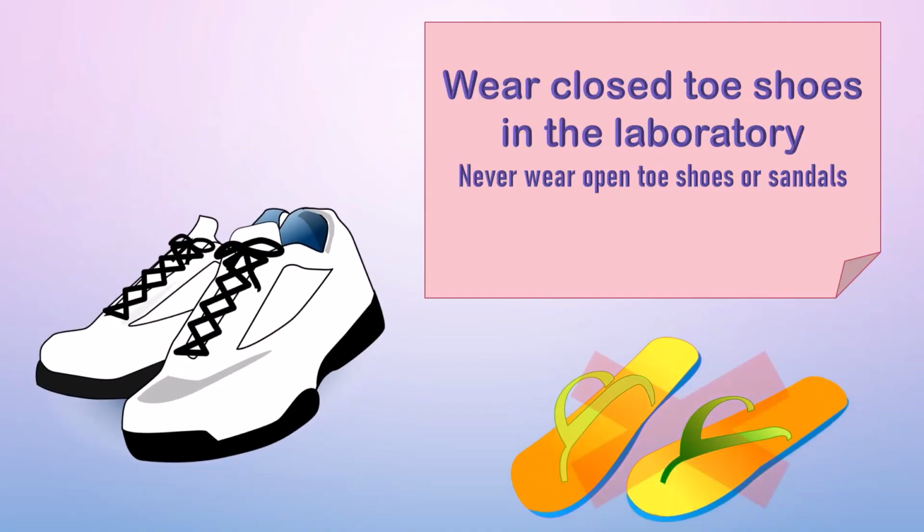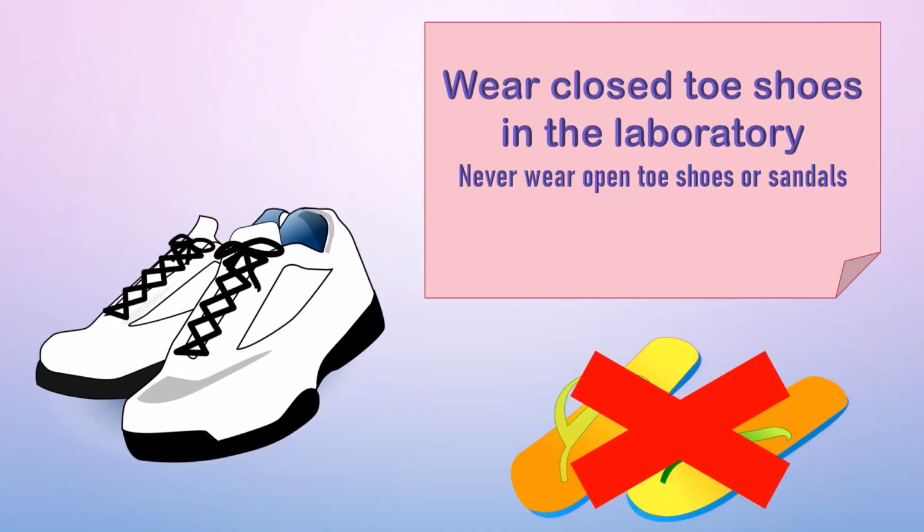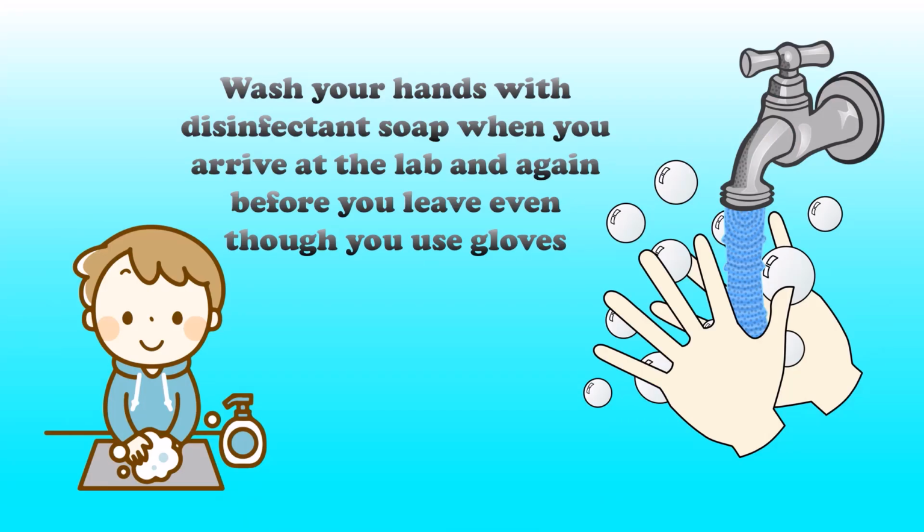We need to wear closed-toe shoes in the laboratory and never wear open-toe shoes or sandals, to avoid any toxic pouring on our feet or walking on broken glass. Then, wash your hands with disinfectant soap when you arrive at the lab and again before you leave, even though you use gloves.